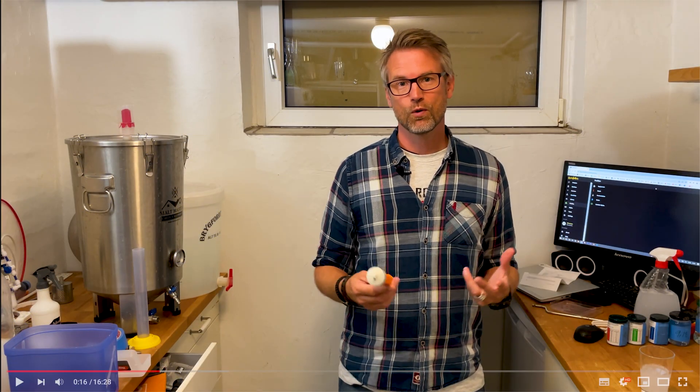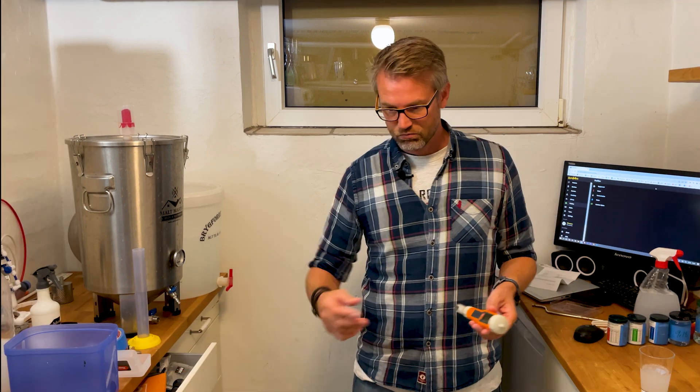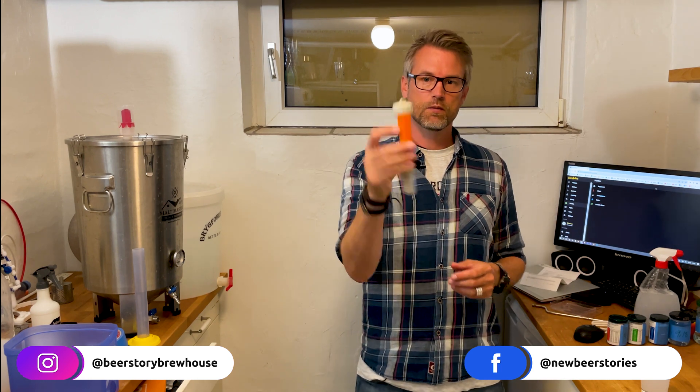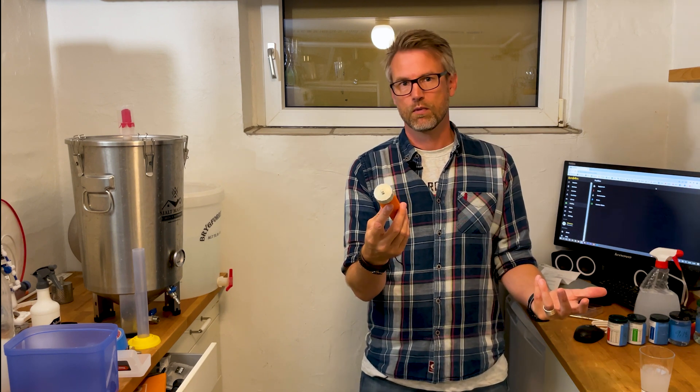When brewing beer it's really important that you know your equipment is accurate and you maintain it properly — regarding temperature, gravities, and especially your pH meter. These are highly sensitive and should be calibrated at least once a month.